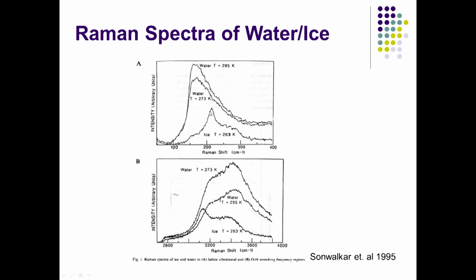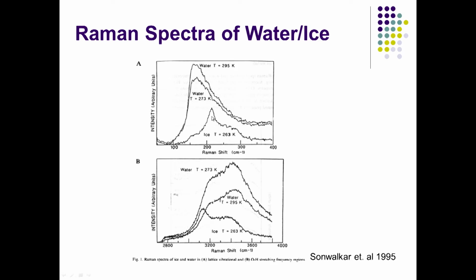And so, in this case, this is called OH stretching, and there are two OH stretching. So, if you look at oxygen and hydrogen, there are two bonds. One is in phase, another one is out of phase. So, this is the in phase, which essentially formulates a very sharp peak. The out of phase has a peak, but it is, I would say, a broad peak.